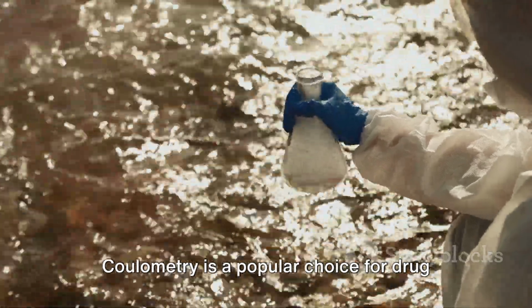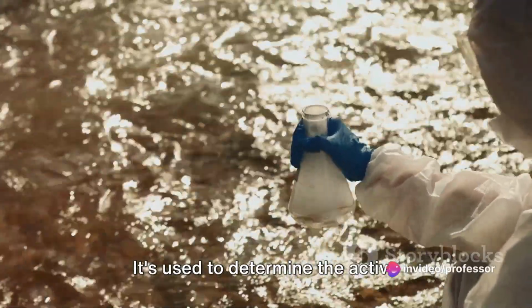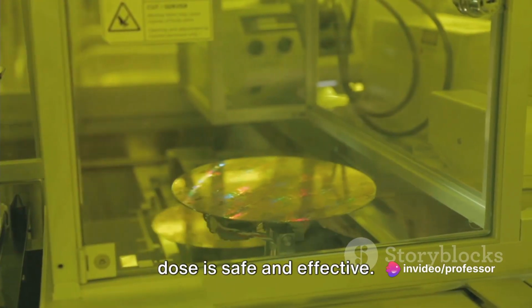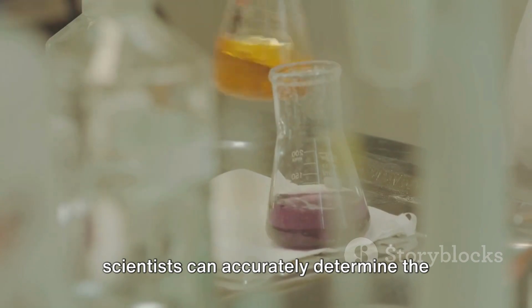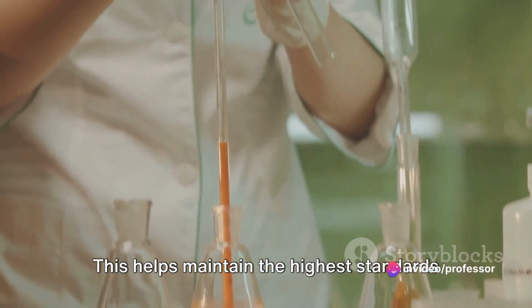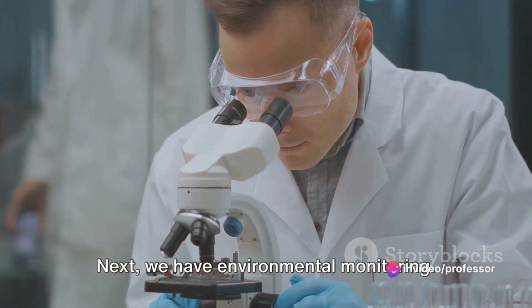Coulometry is a popular choice for drug analysis due to its outstanding accuracy and precision. It's used to determine the active ingredients in a drug, ensuring that each dose is safe and effective. By measuring the amount of electrical charge needed to produce a reaction, scientists can accurately determine the purity of the drug compound. This helps maintain the highest standards of quality and safety in the pharmaceutical industry.